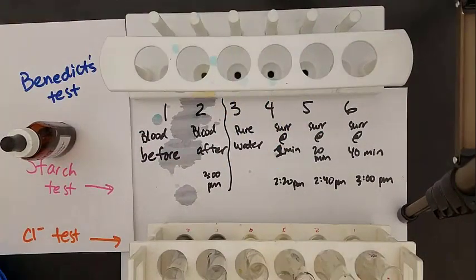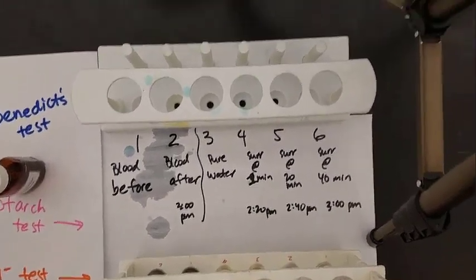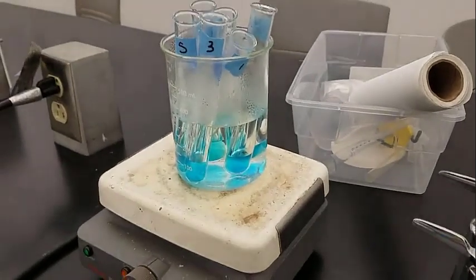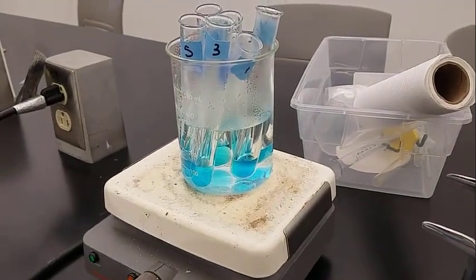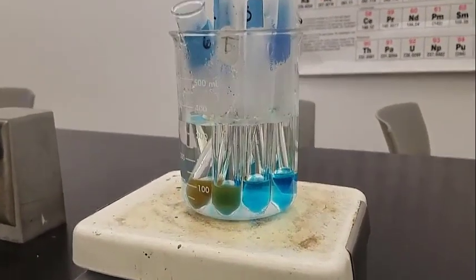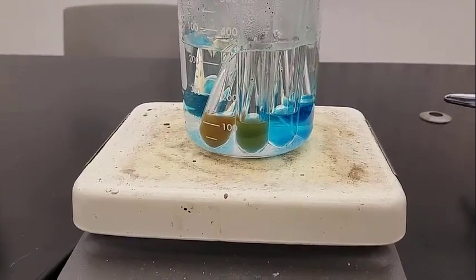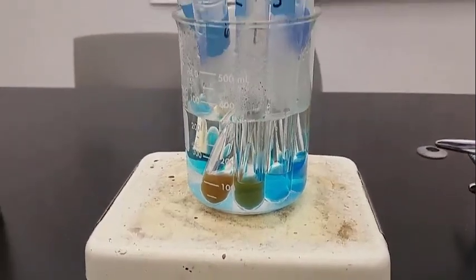We'll put these into a large beaker sitting on a hot plate with boiling water. You'll see it start to boil in a couple minutes. We're watching for color change. Some test tubes are starting to turn greenish and reddish. They're not transparent anymore—you can't see through them. That means there's a solid there.